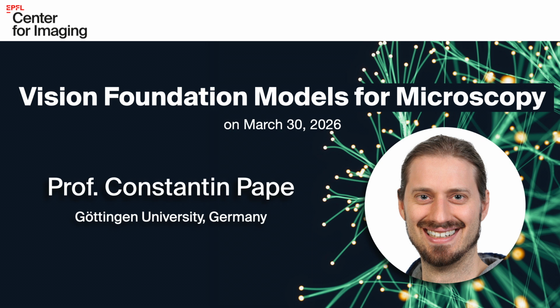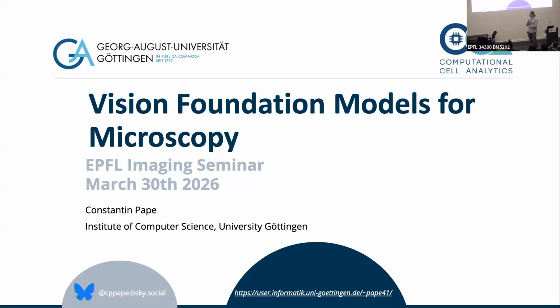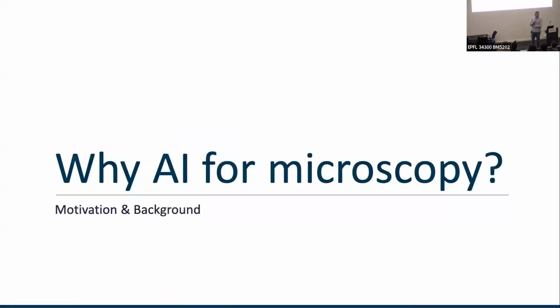I'll talk about the work in the lab, focusing on these vision foundation models for microscopy. I'll explain a bit more what we mean by this later on in the talk. First, why do we even care about these deep learning models? We now all say AI about it for microscopy. So what's the motivation to work on this?